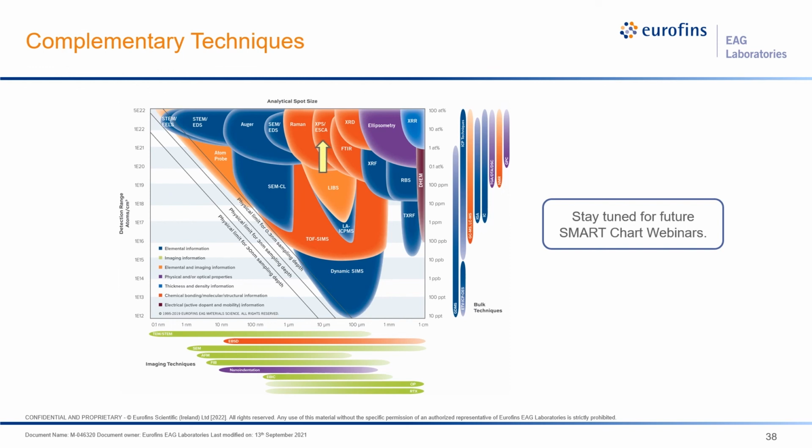XPS, a very similar surface analysis technique, generates binding energies of photoelectrons from X-ray sources, so it can handle insulators quite easily, and has a fairly decent spot size of some tens of microns, 100 microns or so. Auger cannot provide much chemical information for organic compounds, but Raman can be used on areas as small as a micron to identify small organic or organometallic particles.